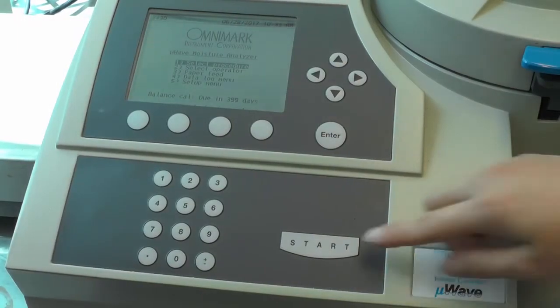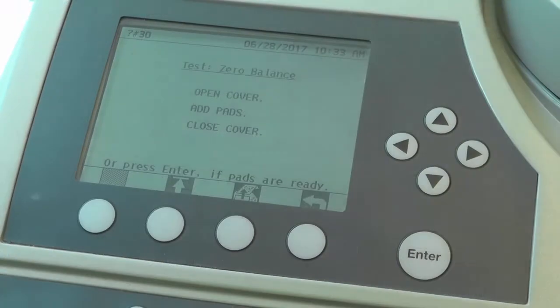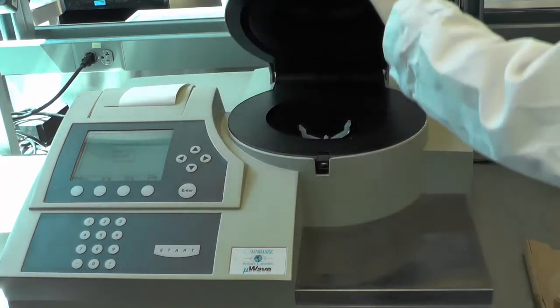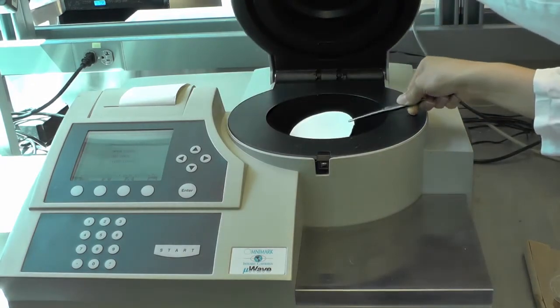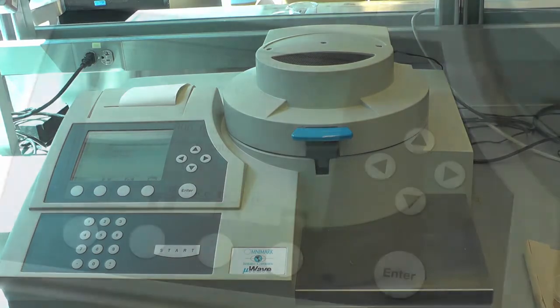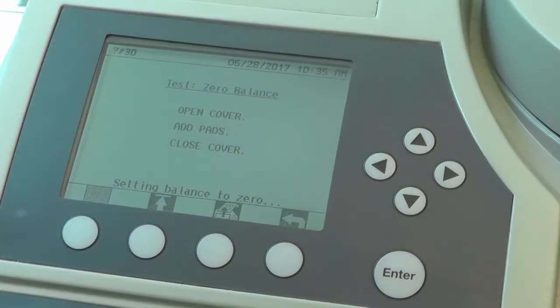Press the start key to initiate a sample analysis test cycle. The display screen will prompt you to open the cover, place one or two sample pads onto the sample support, and close the cover. It will automatically zero the balance.